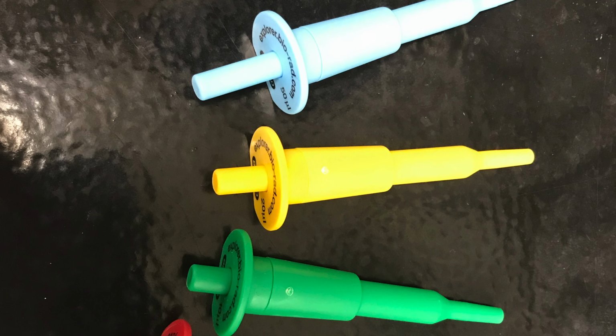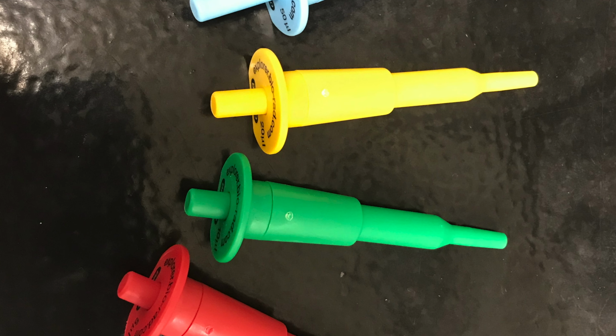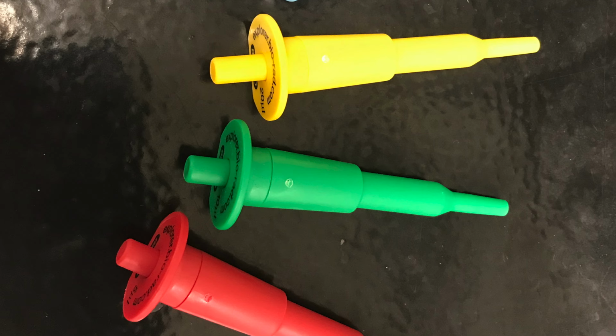However, you are limited to the volumes that you have with your pipettes, and if you want a volume that's different, you have to combine volumes from different pipettes.